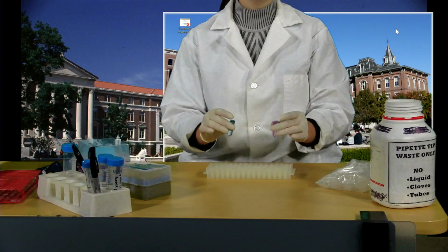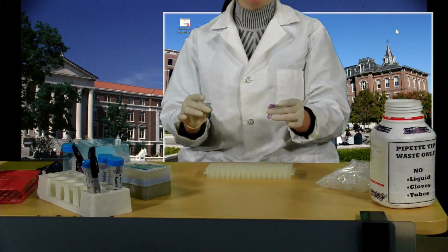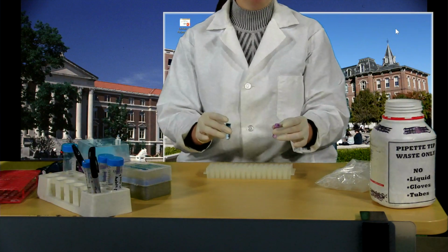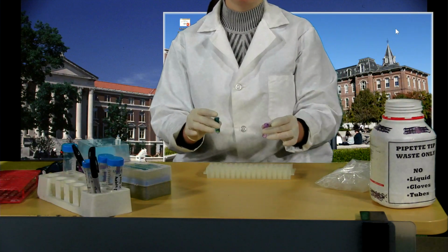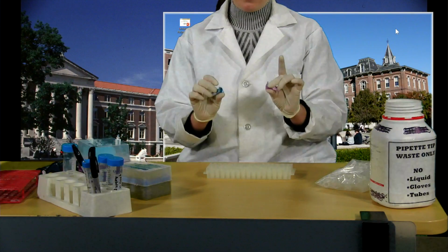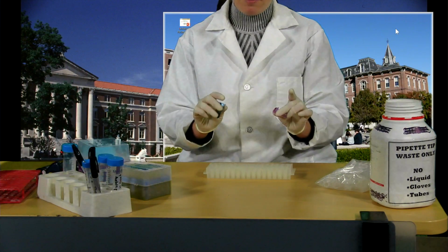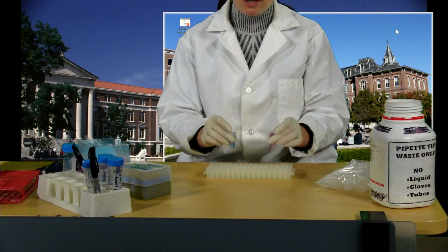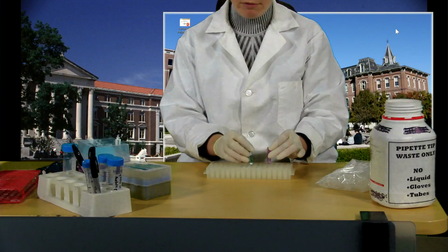So you will need to look at the directions that you've been given. If you don't have the total fraction in front of you, have a look and see if you can find information in what you've been given on what the total fraction volume was. Like I said, this is only a sample of that. Now we can still determine a lot from just these two samples. So I have my crude and my purified.